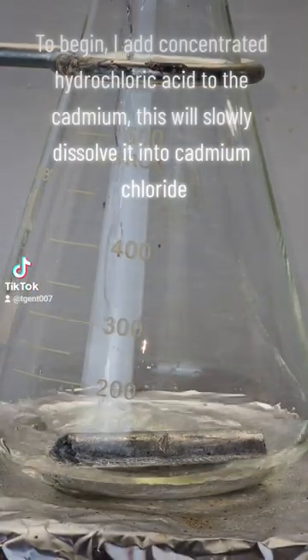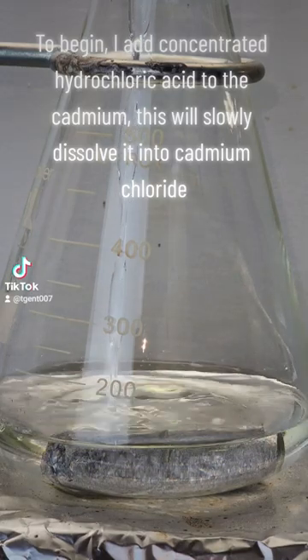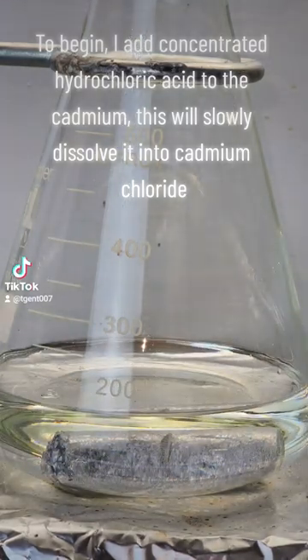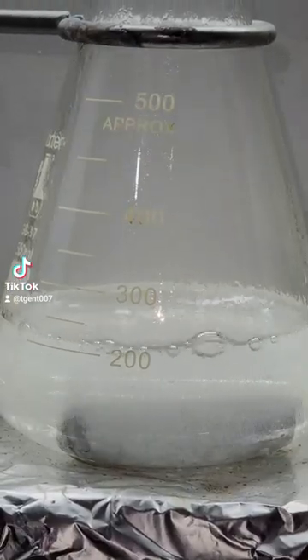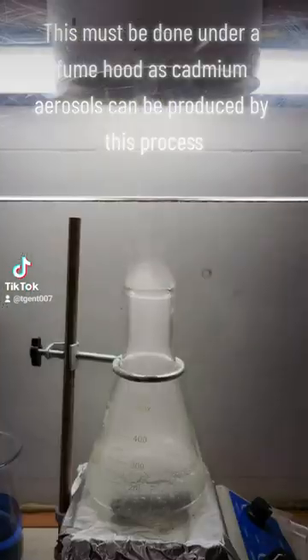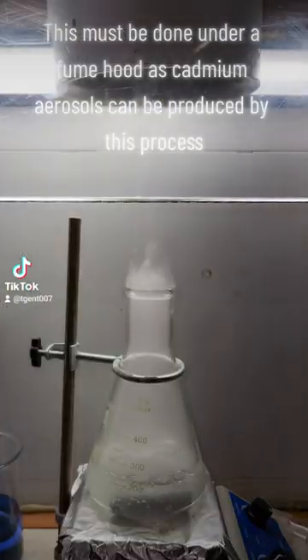To begin, I add concentrated hydrochloric acid to the cadmium. This will slowly dissolve it into cadmium chloride. This must be done under a fume hood, as cadmium aerosols can be produced by this process.